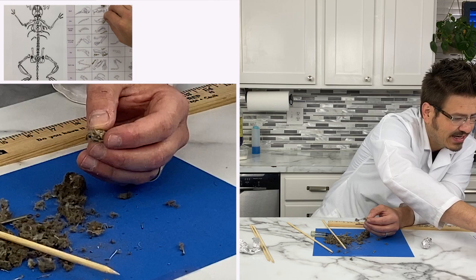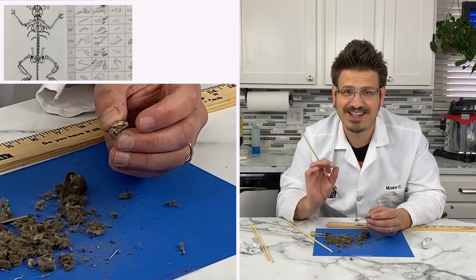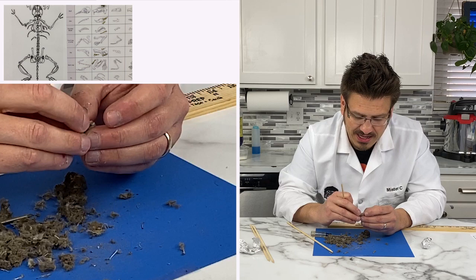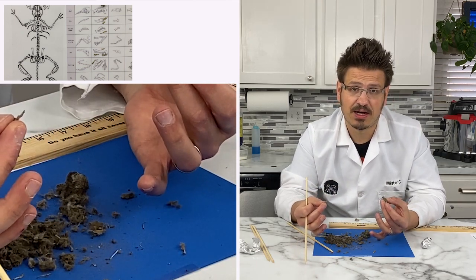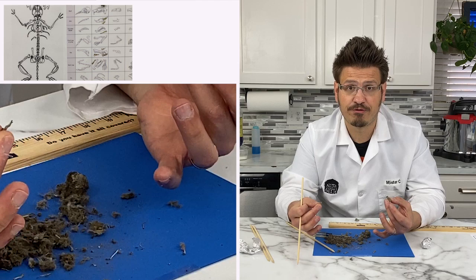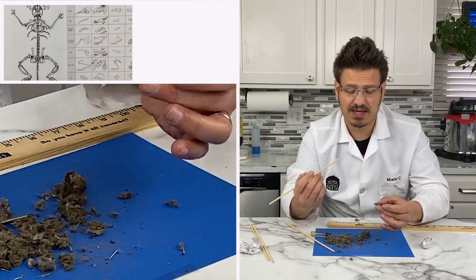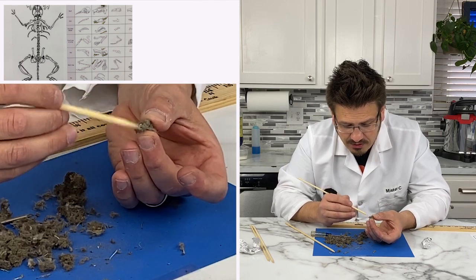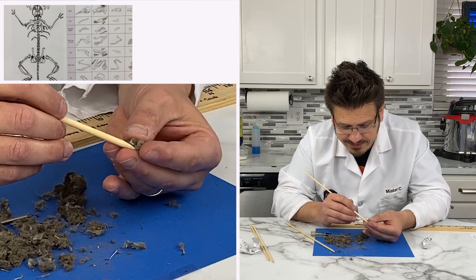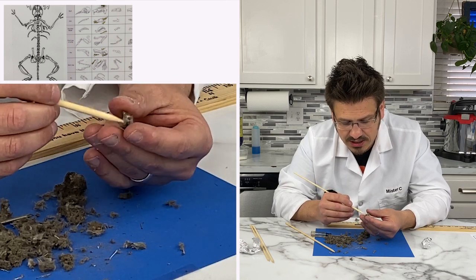Yes, yes! I love it when we find more than one rodent inside of an owl pellet. It tells me that the owl probably is a bigger critter, because it's searching for more food, hunting more food. I'm just making that hypothesis there. I'm not 100% sure. I wish I had a pet owl. Oh my gosh, the skull is so tender when you touch it.